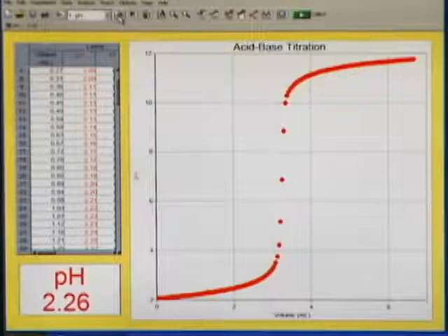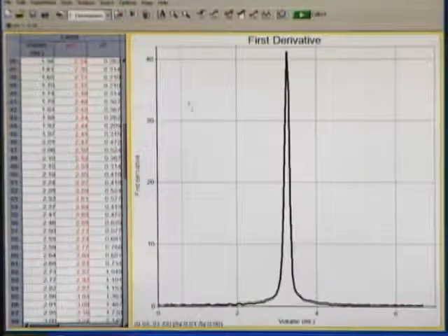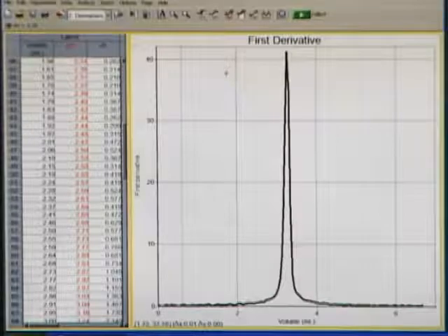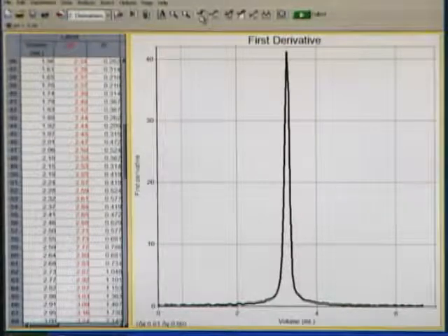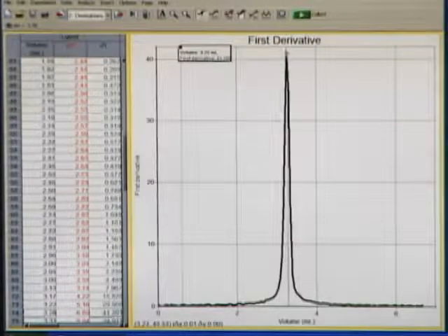So up here in the toolbar, I'm going to click on the next page button, which takes us to the first derivative. The peak of this first derivative peak is going to tell us what our equivalence point volume would be. If I turn on the examine button on the toolbar and come over here to the peak, it is showing us that the volume is around 3.2 milliliters for that equivalence point.